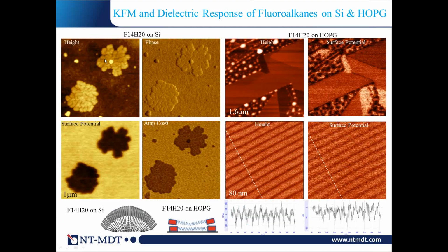You see, in principle, we can go into multi-frequency measurements. We can get height and mechanical phase simultaneously. You see, we use really low force, and this is very important because if we want to deconvolute mechanical and electric interaction, we really need to do imaging very carefully, with very small forces, not to disturb or complicate the situation.